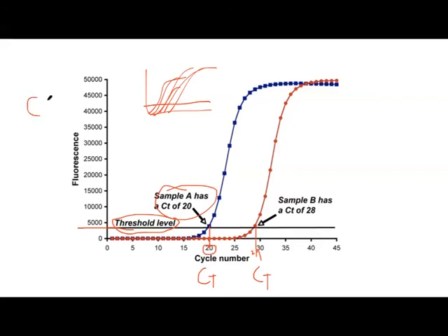If I'm studying 2 samples, with 2 tubes here, and I have so many messenger RNAs of different genes that are expressed, and I design a primer that only detects this RNA, and here I have 2 copies of this RNA, this sample is more concentrated than this one for this specific gene, this specific messenger RNA. So that's why this sample will amplify earlier.